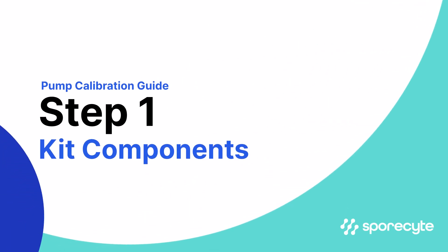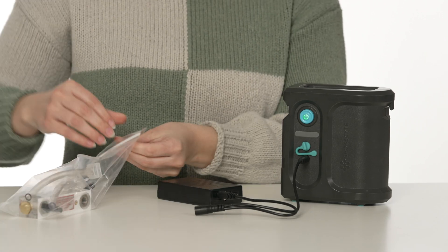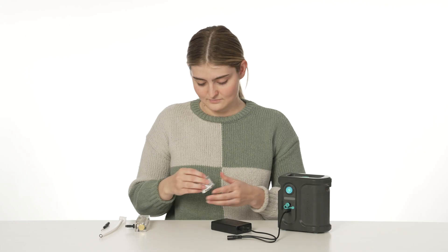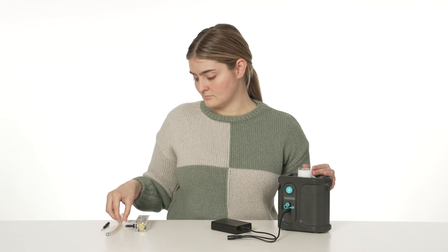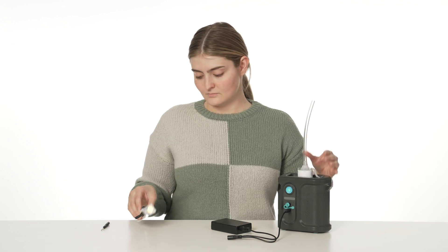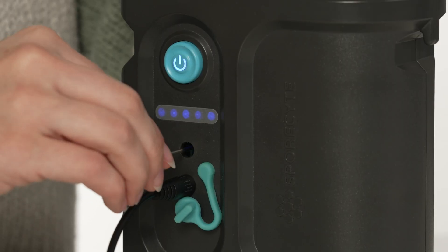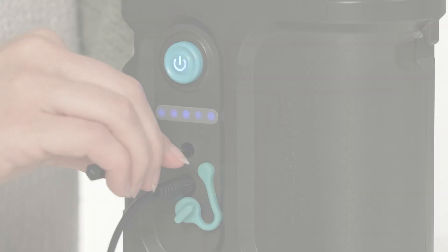Let's start with the tools included in your pump kit. You'll find the Sporecyte air sampling pump, calibration adapters for various air sampling cassette types, a barbed tubing adapter, a rotameter, a 12-volt power adapter, and a Phillips head screwdriver for calibration adjustments.